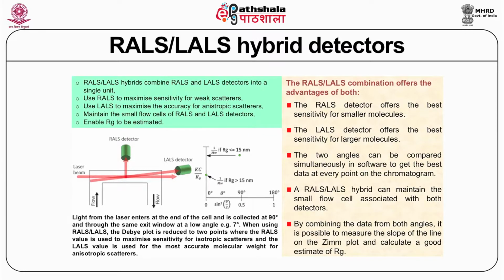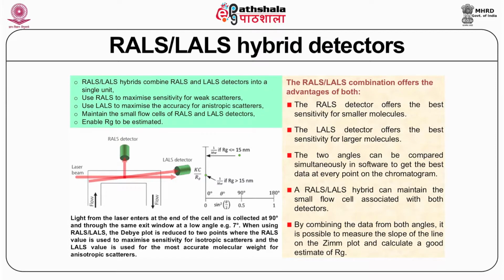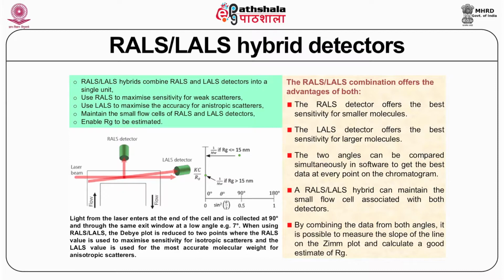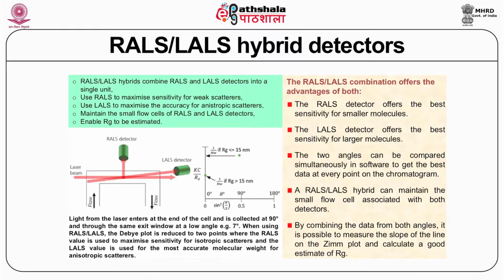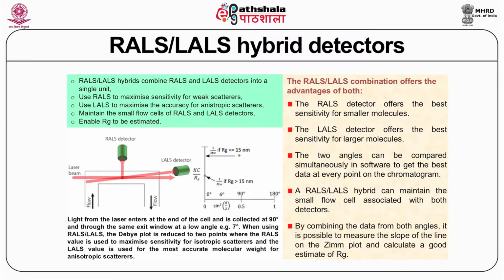The RALS LALS combination offers the following advantages, such as the RALS detector offers the best sensitivity for smaller molecules and the LALS detector offers the best sensitivity for the larger molecules.